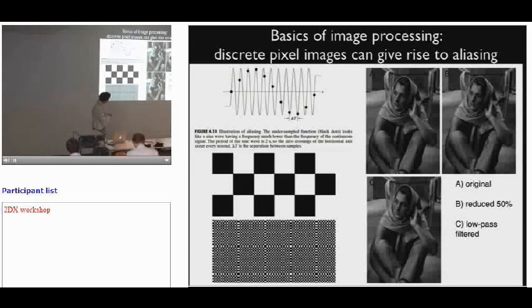Another real space illustration for this is this image here. If you look at these trousers, they have a longitudinal pattern in real space. So this is our original highly accurate image. Then we reduce the overall image by 2 times, and what you end up with is a new transverse striation on this pattern, and this is a result of aliasing. The only way to really get around this is to apply a low-pass filter before reducing the image, and I guess that can also be a problem when working with highly periodic images.